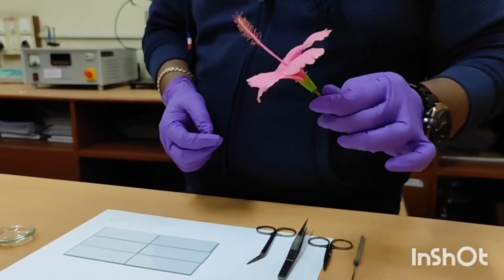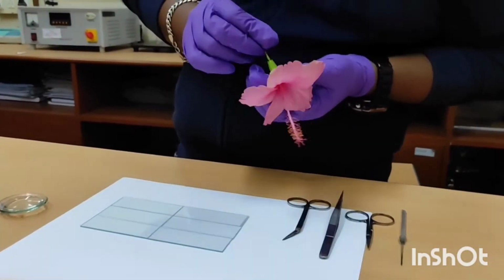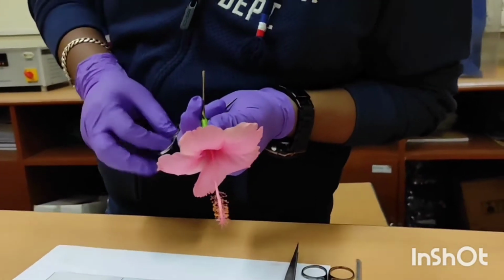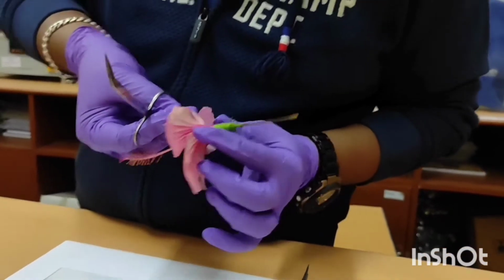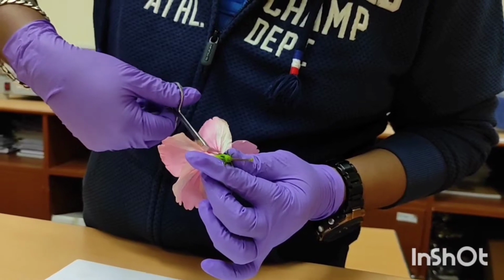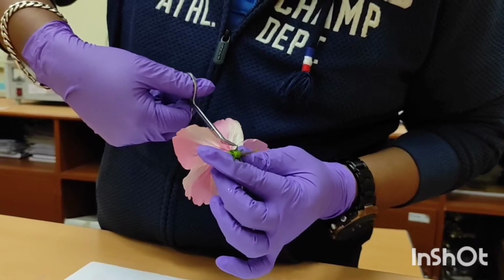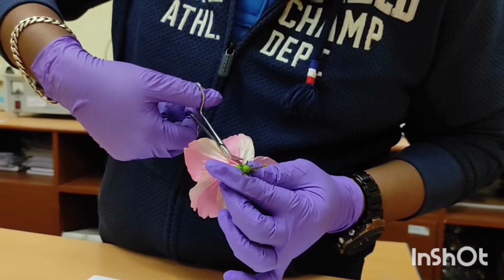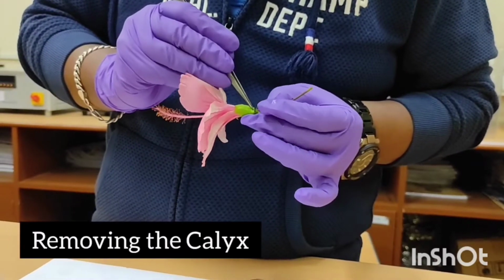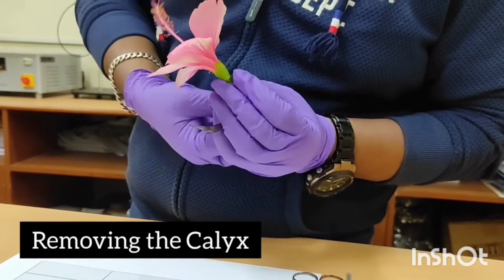Today we are going to dissect a flower of Malvaceae family. It is a dicot family. Today we have taken Hibiscus rosa-sinensis flower for the dissection purpose. Dear students, please don't forget to put the hyphen in between rosa and sinensis when you are writing this scientific name in your exam copy.